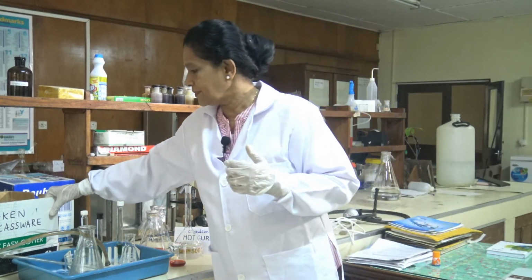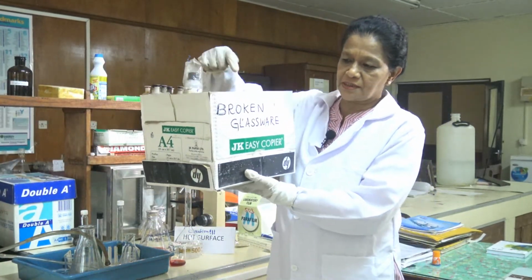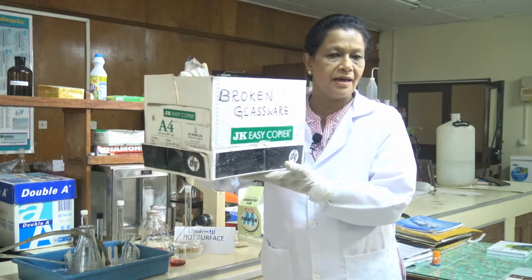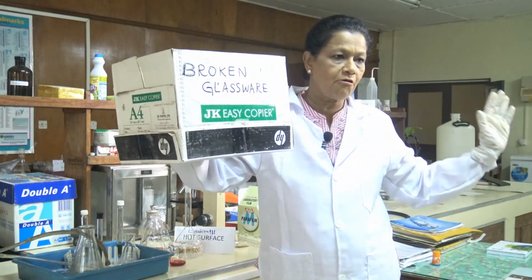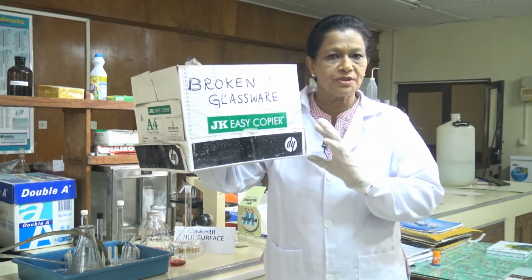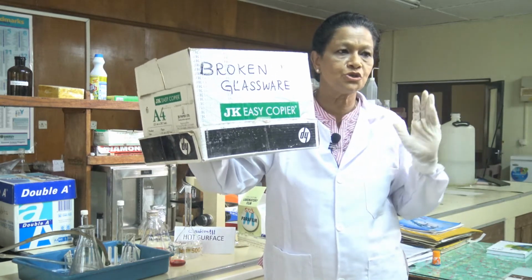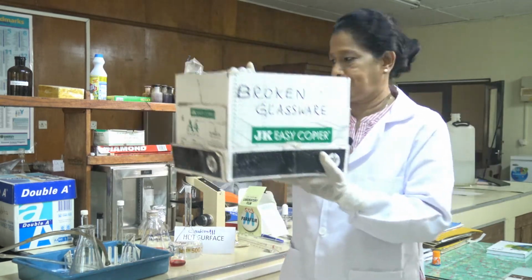And finally, the damaged or broken glassware should be collected separately, put into a box and label the box as broken glassware and keep it in a corner of the laboratory, and remember to dispose of this separately. Do not put this into the usual bin.